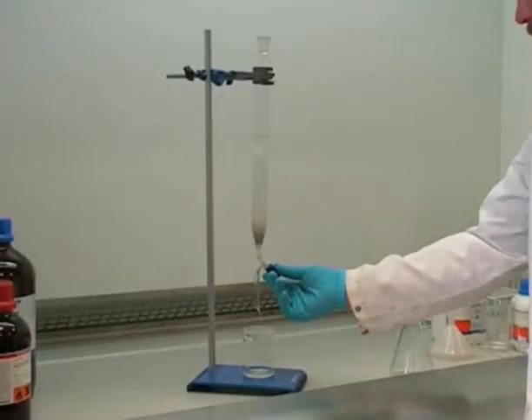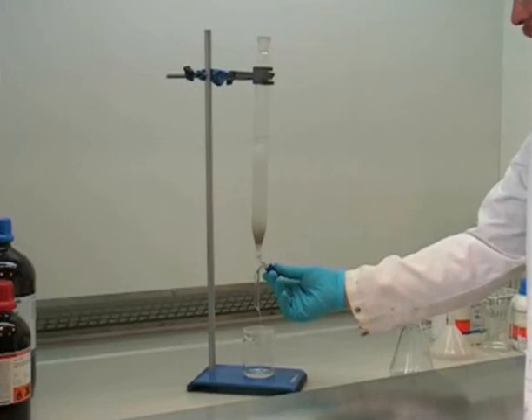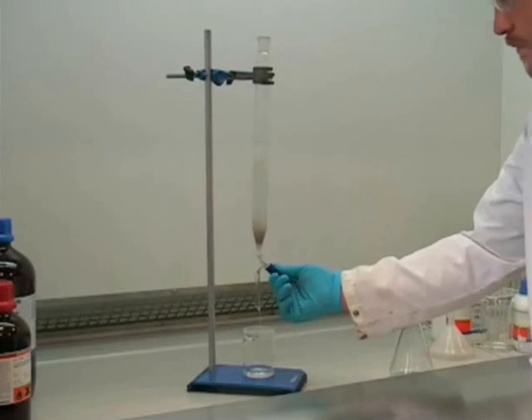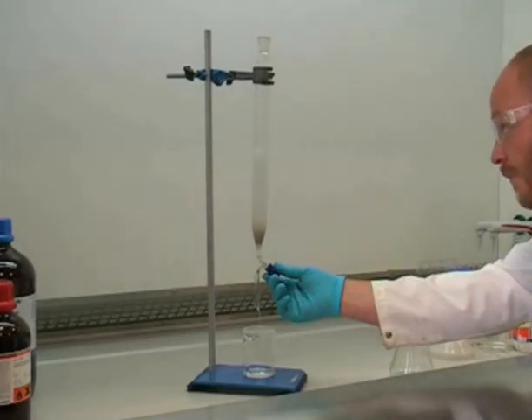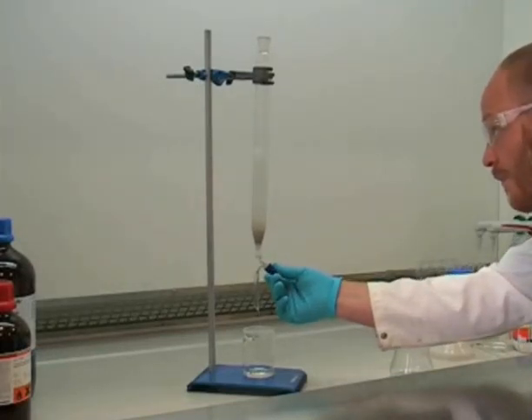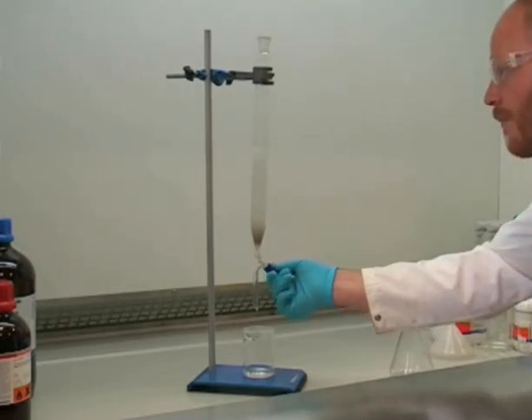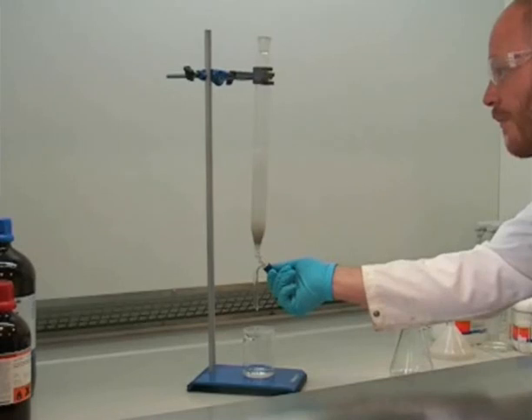It's crucial that you don't allow the silica to run dry, so you need to keep a close eye on the level of the eluent and close the tap at the appropriate moment. Here you can see we've run the eluent down to the correct level so that the top of the silica has not dried out.